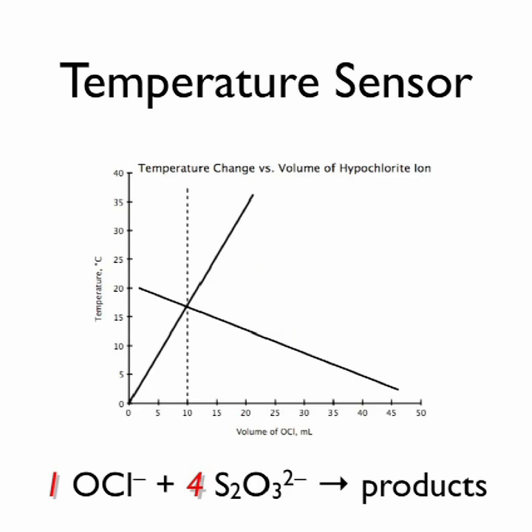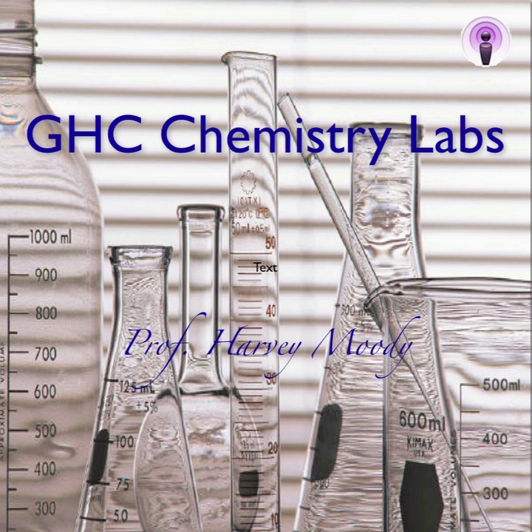Now, fill out your report and balance the reactants in your report sheet for the reaction of the hypochlorite ion with the thiosulfate ion.